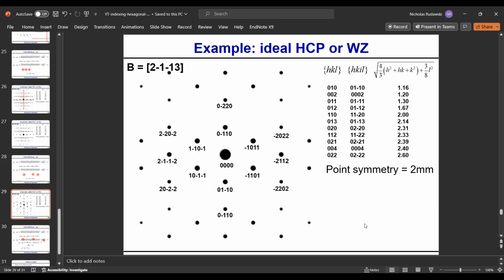Okay, so last thing, if we want to do it, is if we want to apply soft rules. Let me copy this and paste it. If we want to apply soft rules, we're constrained to keeping the 3 here. We can't move that, that has to be there. But what we can do is we can do 1, 1, 2 bar 3. We can do that.